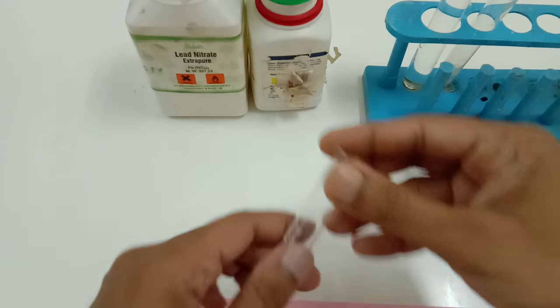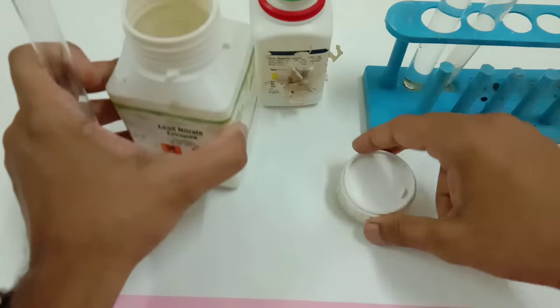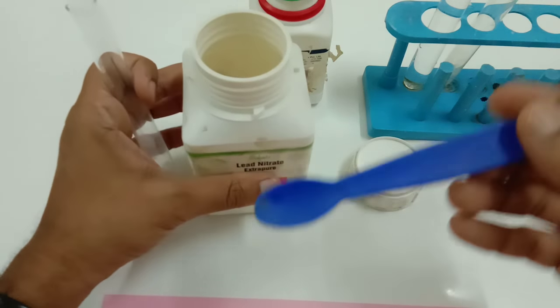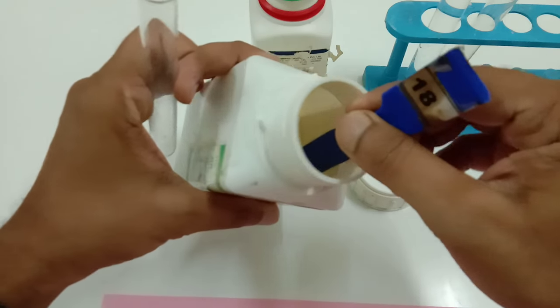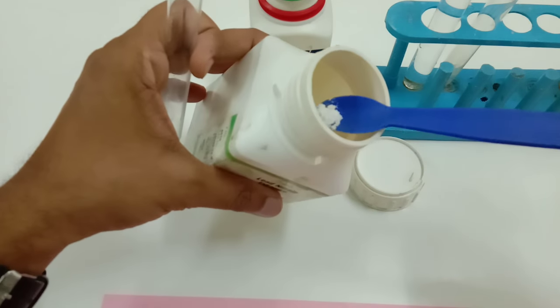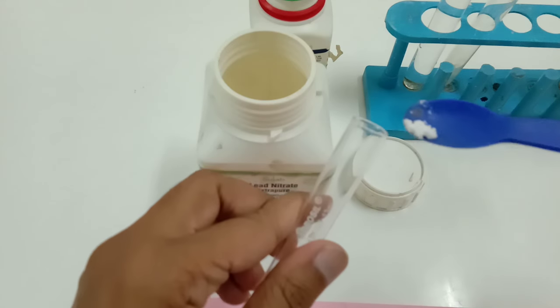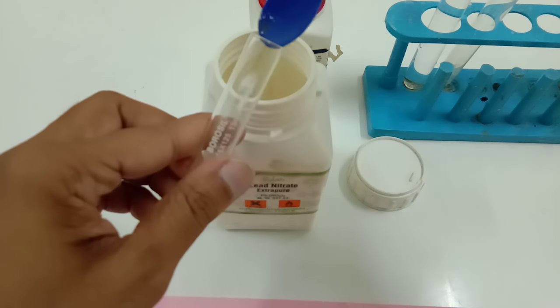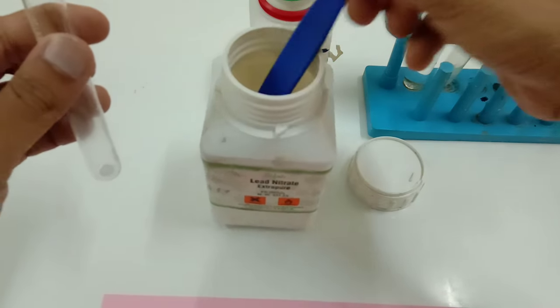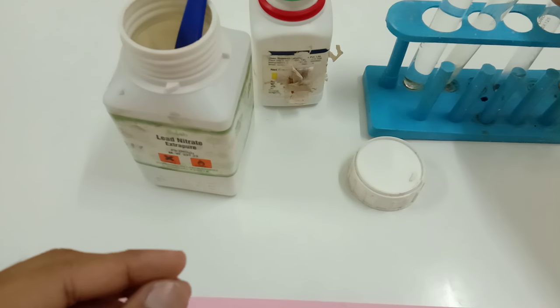First of all, I am going to take some lead nitrate, that is Pb(NO3)2, a very small pinch of it, and I am going to place it over here.